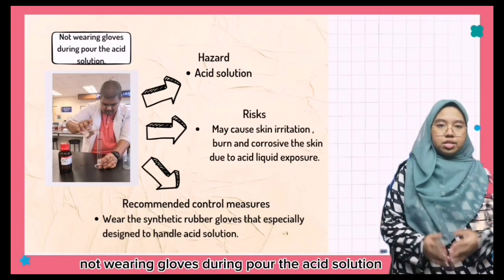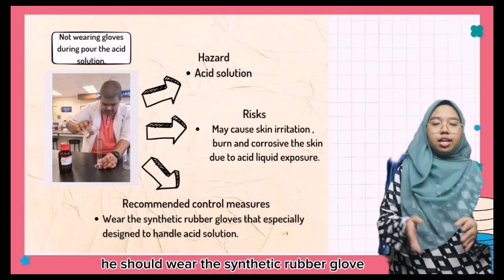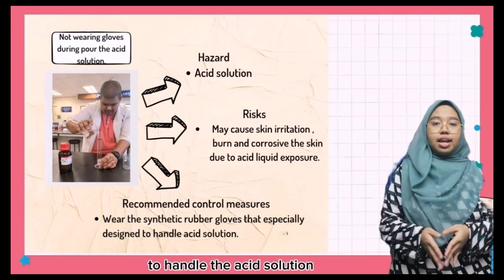Not wearing gloves while pouring acid solution. The risk is it may cause skin irritation, burns, and corrosion of the skin. He should wear synthetic rubber gloves to handle the acid solution.